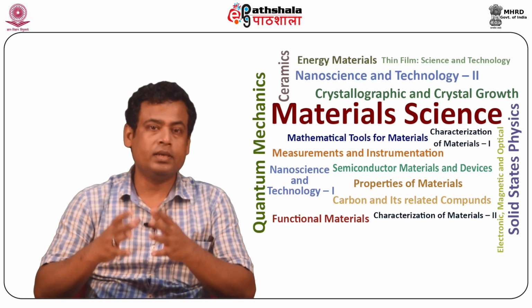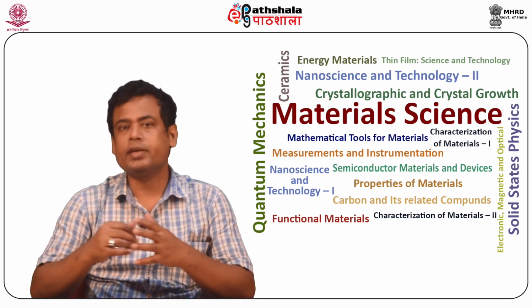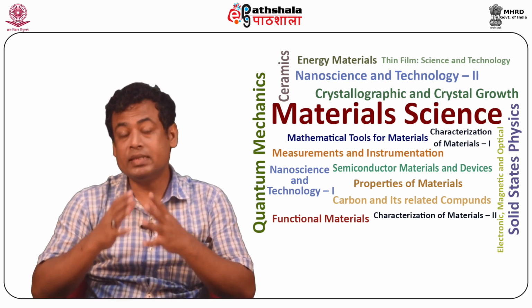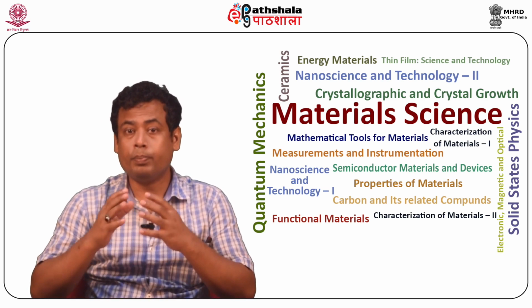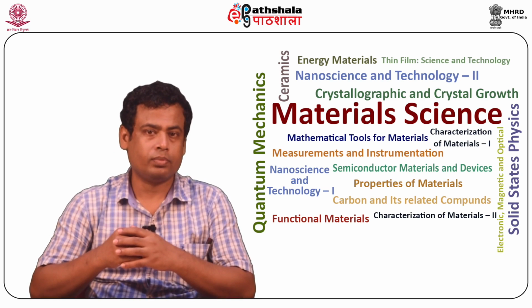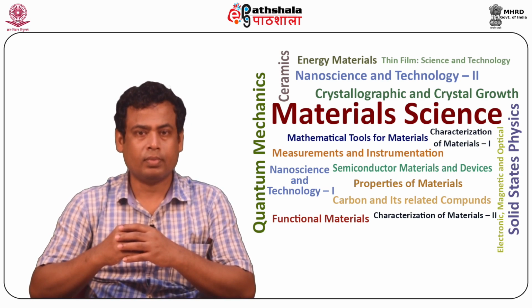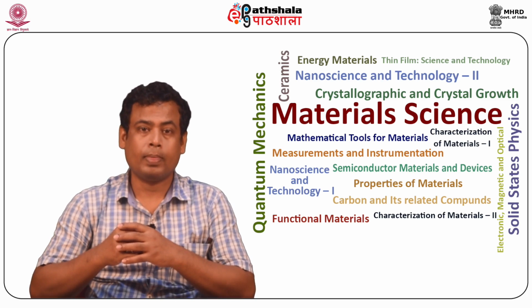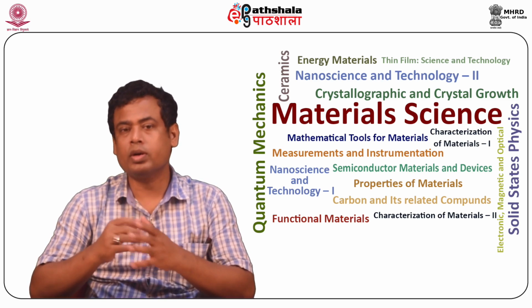Now let us see what the different issues with insulating materials are. In insulating materials, it is difficult to remove the incident electrons on the surface of the material by electrical conduction methods through the material. This causes accumulation of electrons, and the surface of the sample becomes negatively charged during Auger electron spectroscopy.